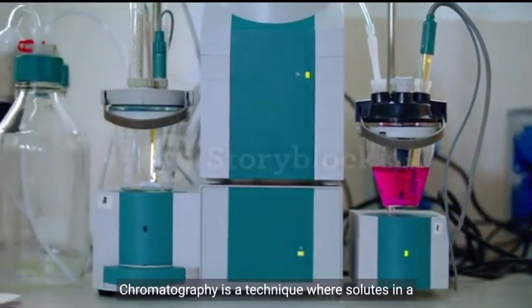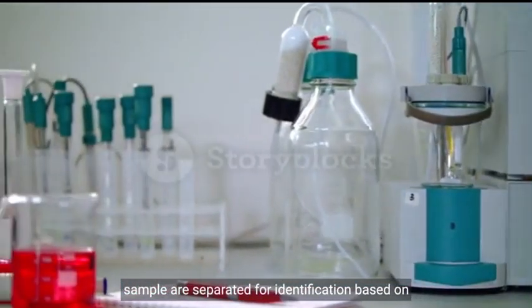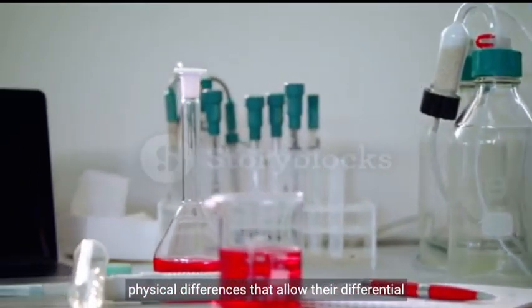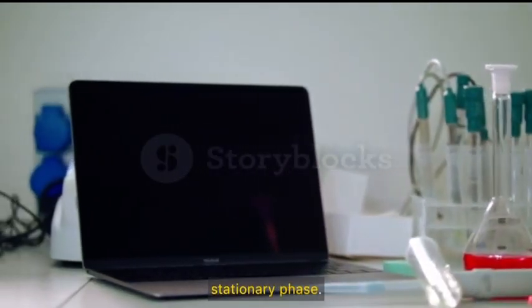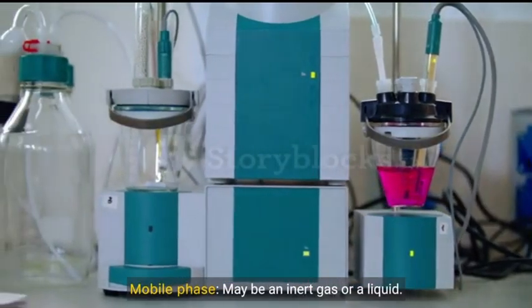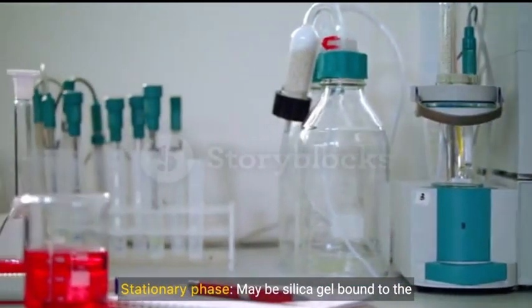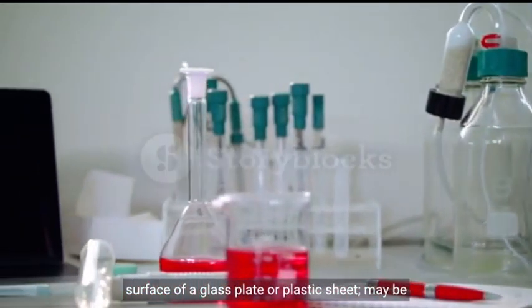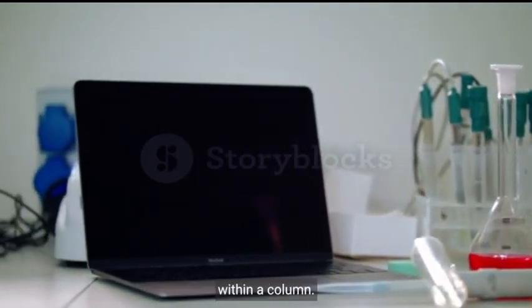Chromatography. Chromatography is a technique where solutes in a sample are separated for identification based on physical differences that allow their differential distribution between a mobile phase and a stationary phase. Mobile phase may be an inert gas or a liquid. Stationary phase may be silica gel bound to the surface of a glass plate or plastic sheet. May be silica or a polymer that is coated or bonded within a column.